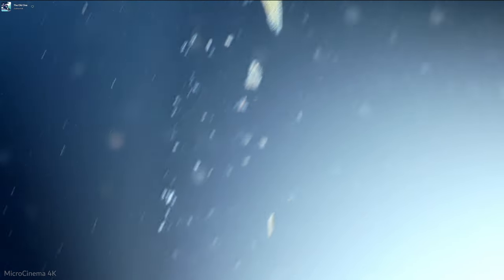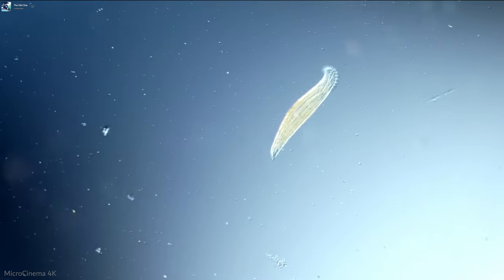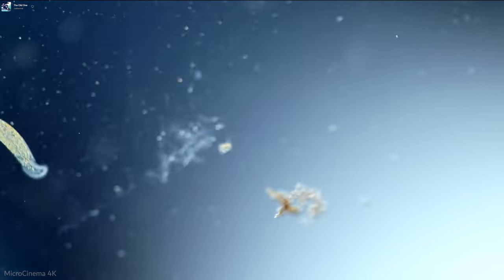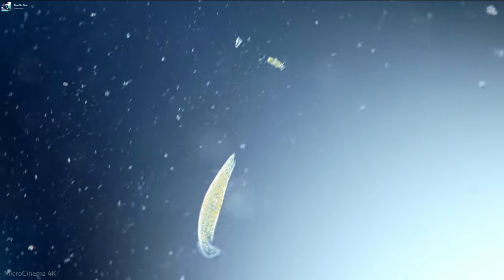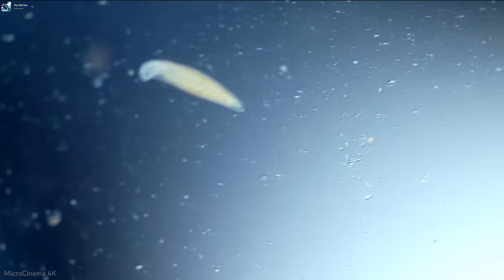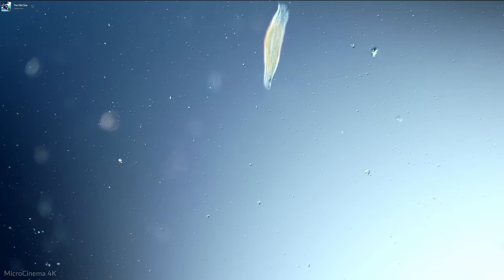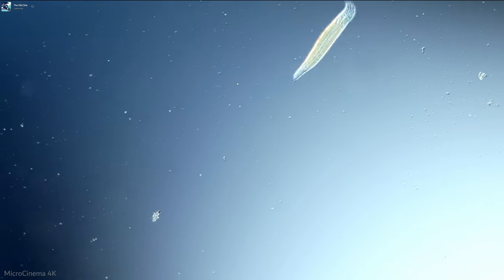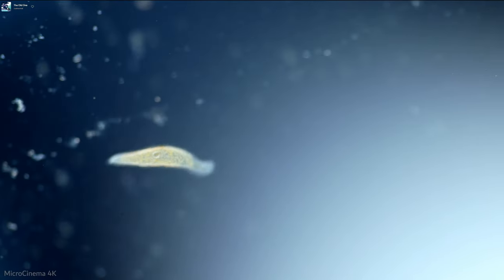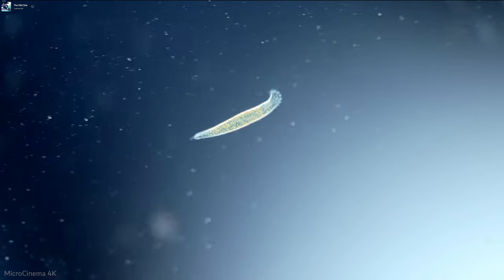So I think this is a Loxodes of some kind. And there are actually a whole bunch of these in this sample. And this is a saltwater sample. It's actually quite salty. While I was there doing some collecting, I did a little taste test to measure the salinity. And I can confirm that it is salty. And these Loxodes are all over the place in the sample, which is just kind of unusual for me.